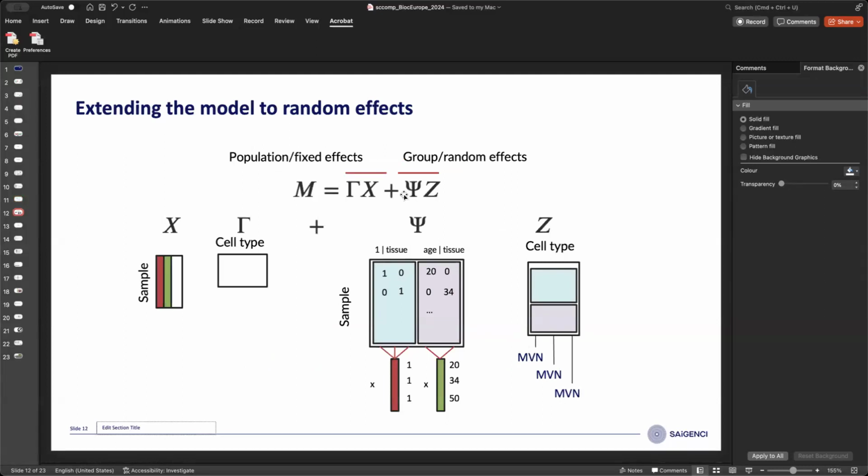This is a small detail, but it's just to give some practicality to how we extended the model, at least in a Bayesian context. So normally you have your observed data that is in a linear model. It's quite simple. So it's a product of your design matrix by the effect matrix, and is shaped as such.